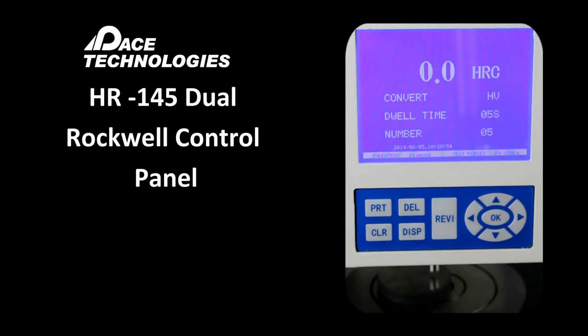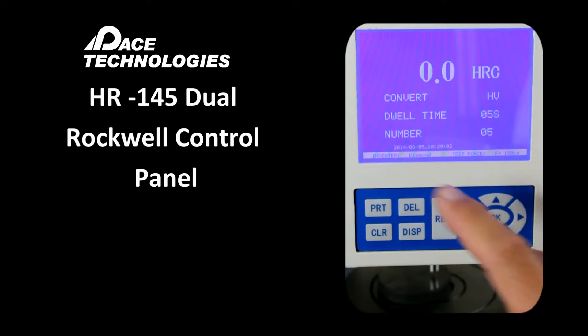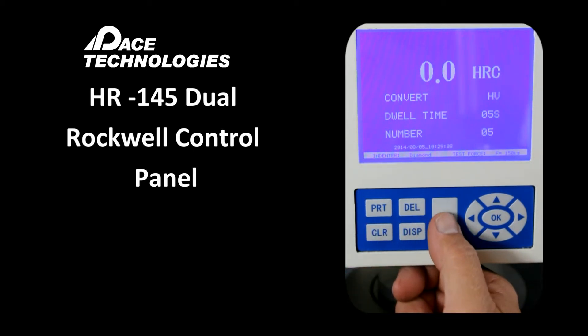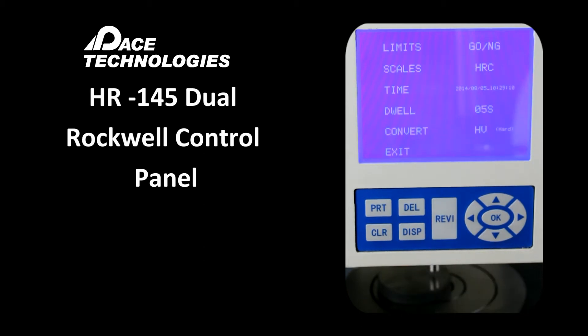The HR145 control panel has an LCD screen that provides information such as conversion, dwell time, measurement number, and hardness. If we press the REVI button, this will show us our parameters.